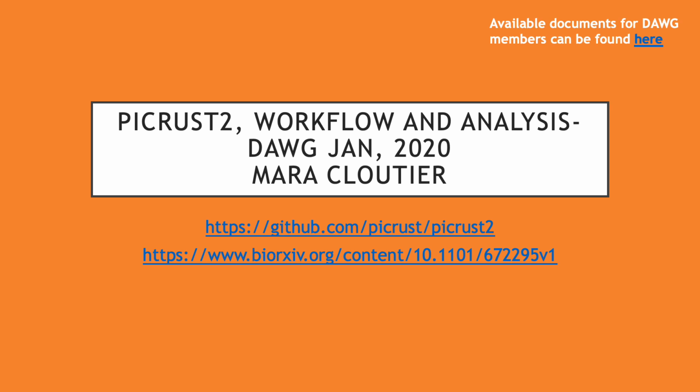I'm a PhD student at Penn State University, and I'm going to be walking you through the PICRUSt2 workflow and getting you ready for analysis either in R or in QIIME 2. If you're here for the documents, you can click on the Here button on the right hand corner to get them if you want to run through the tutorial. If you want to see more information about PICRUSt2, you can go to the GitHub link here, or you can see the paper that is in preprint on this link here.